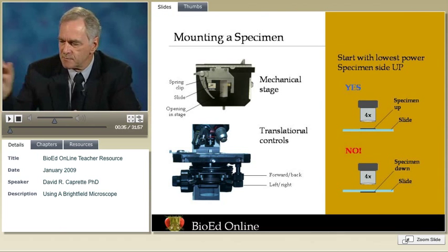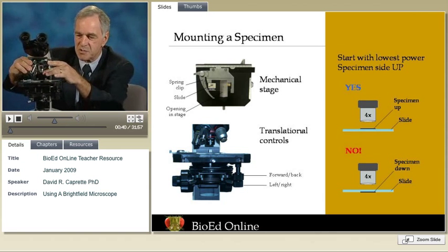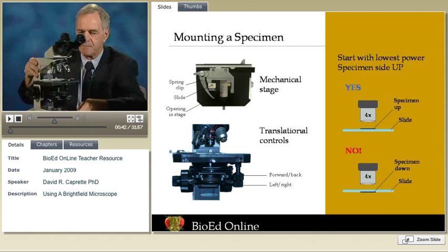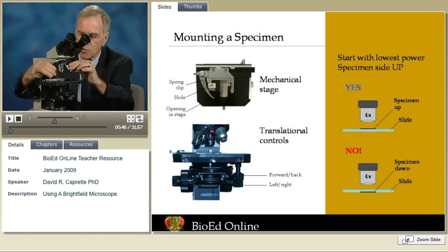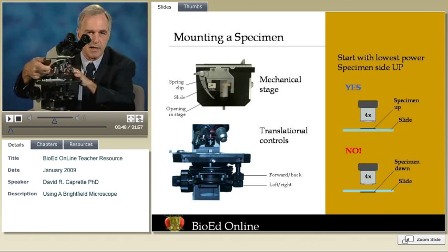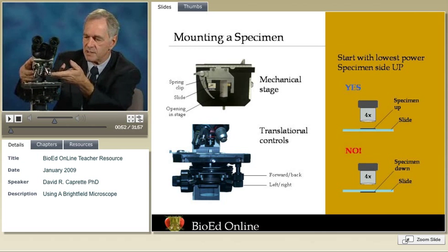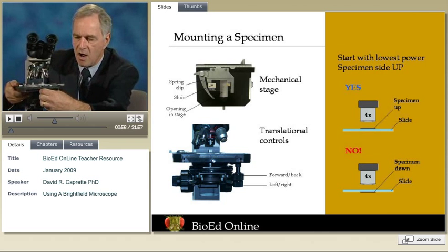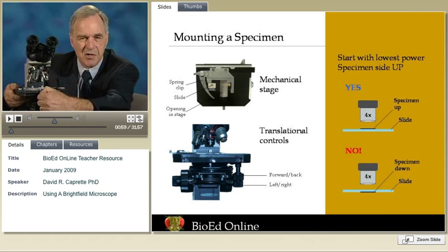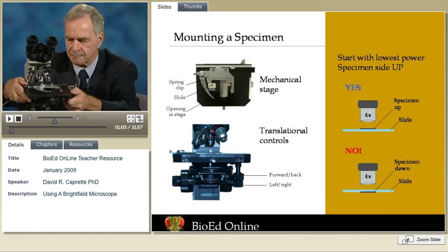For starters, when we mount a specimen, you've got to be very careful. There's a particular way of doing it. You want to start by giving yourself some working distance — have some room between the stage and the objective lens. The best way to do that is to put the lowest power lens in place, because it's the shortest one. Now, I'm going to take the stage off to show you how to mount a slide. You don't want to do this, of course, unless you want to spend the rest of your day trying to get it back in place.